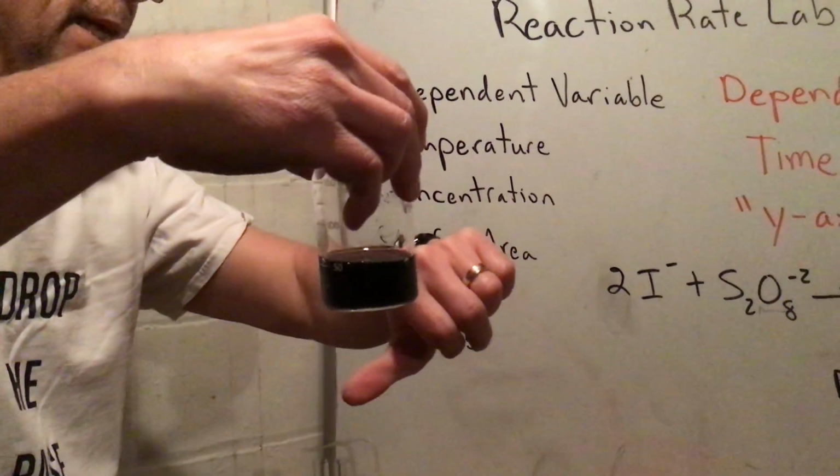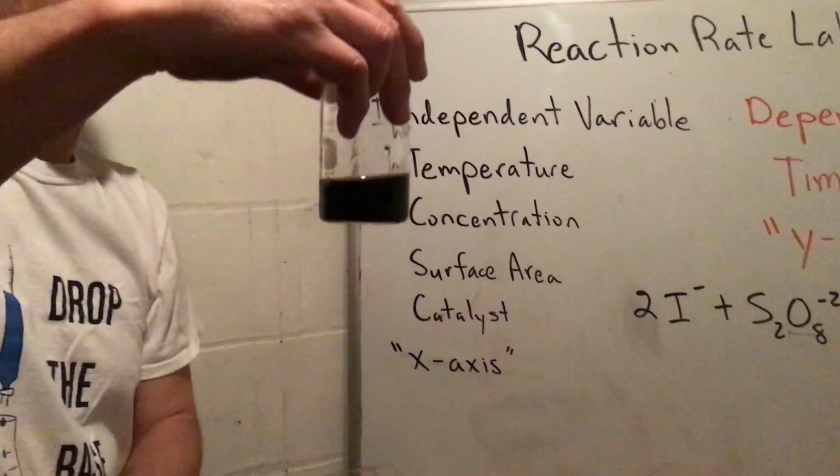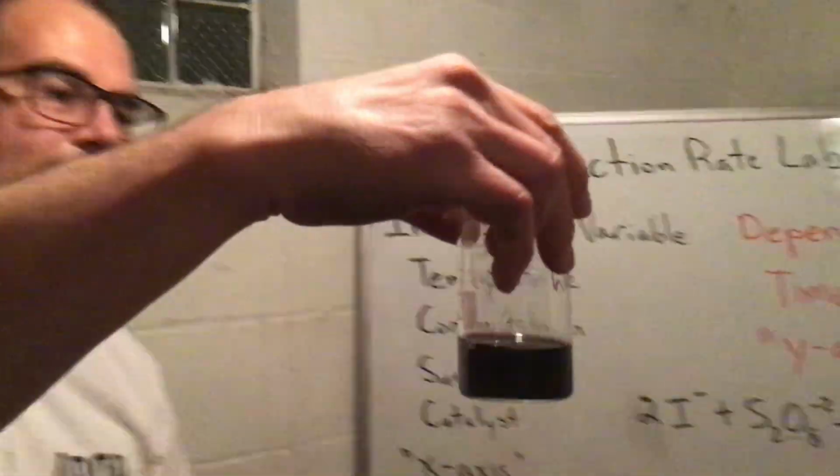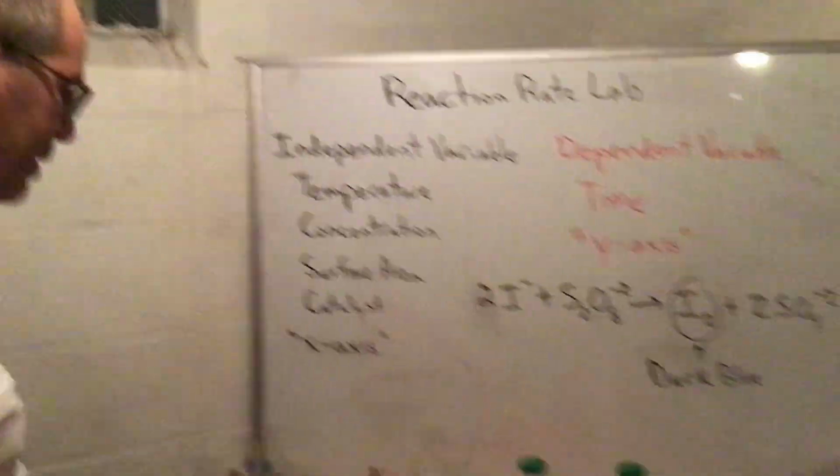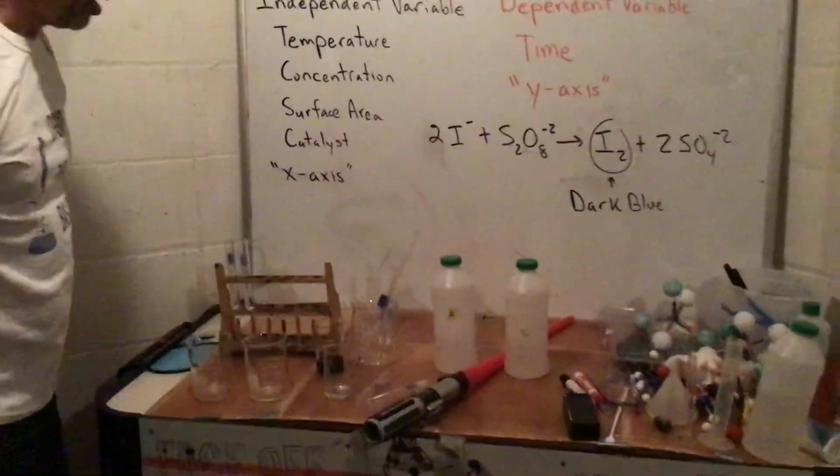Oh, it looks like it's about 37 seconds it turned blue. So at 37 seconds it turned this dark black color, and you can definitely see what happened there.